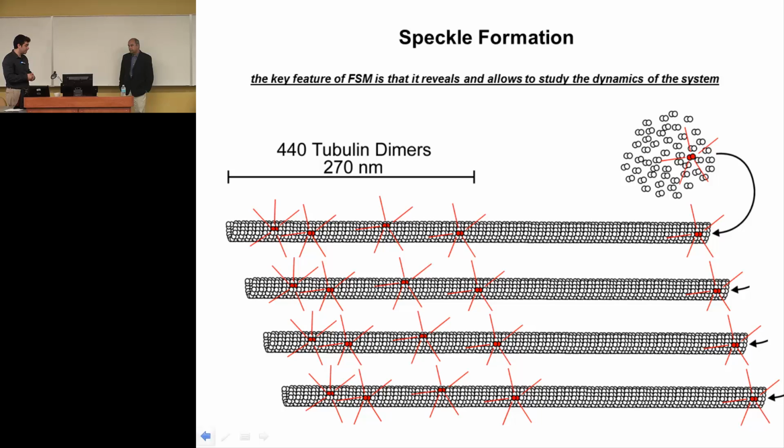But the idea is that the meaning of these individual speckles is that they show translocation of the polymer. So they show that there is motion, and that's why I want to get, let's say, 10,000 or 100,000 of them, because in this distribution there will be enough informative particles. Otherwise, to go down to the individual one, I don't know how we can improve on the detection.